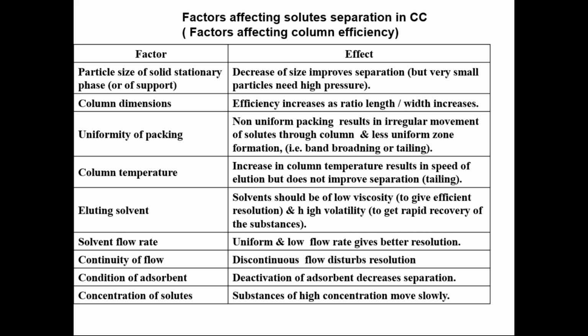In column dimensions, as the length of the column increases, the efficiency increases, and the efficiency also increases when the width of the column decreases.